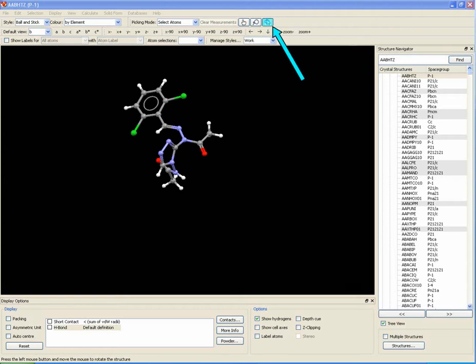This tool automatically reveals what is next to a molecule in any given direction, depending on where you choose.